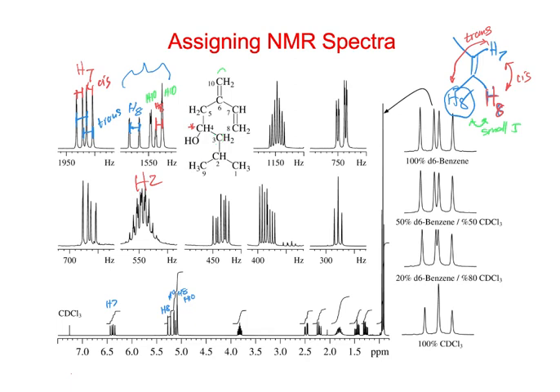So 4.50 or 4.00? Well, just think about the chemical shift. This is a proton on a carbon with an alcohol, with an oxygen. And if we look at any of these down here, maybe only at 4, it's got to be the one near 4, right? I just don't like the splitting pattern. Well, there's going to be some overlap of those peaks. But this one has to be H4.